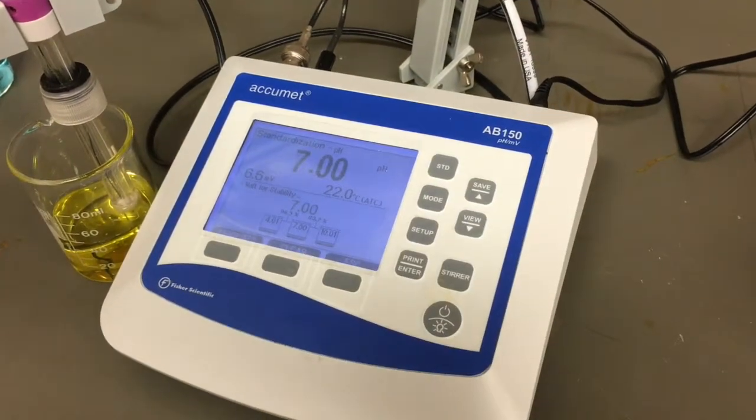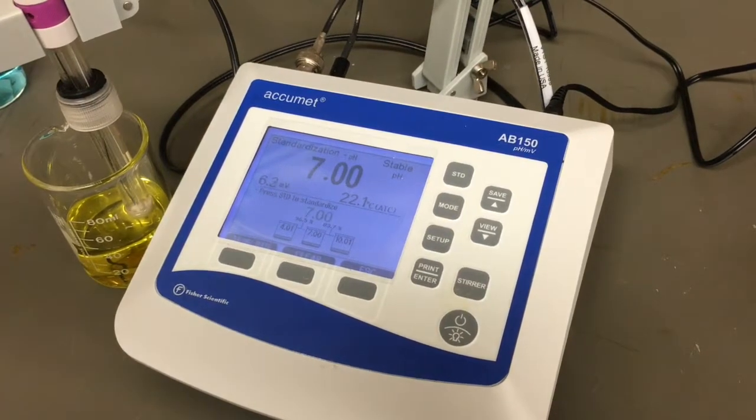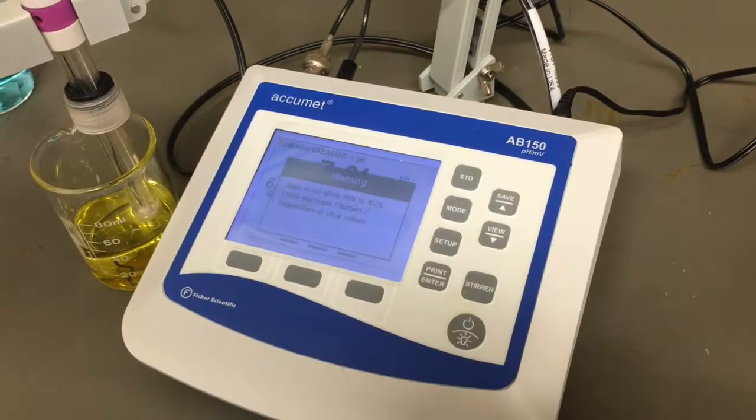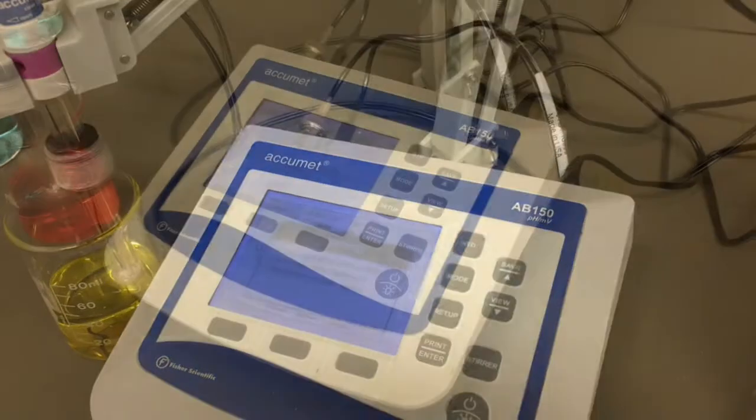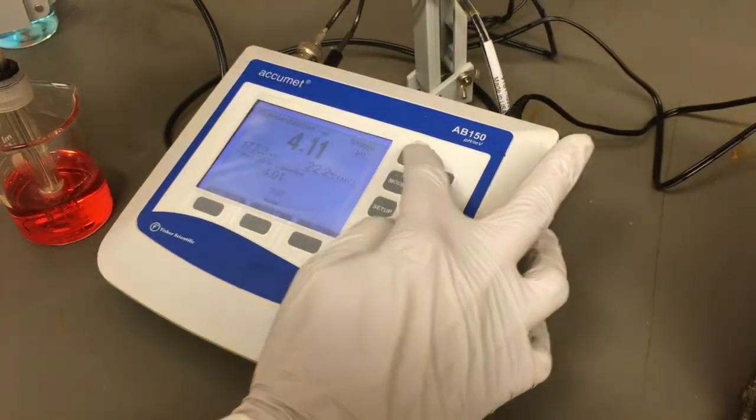If the pH slope is out of the acceptable range, you may get an error when you try to confirm the reading. If this happens, clear the current values, confirm your buffers are at room temperature, and retake the readings.